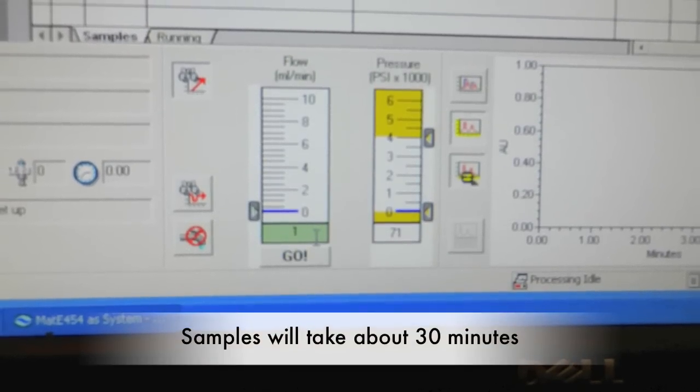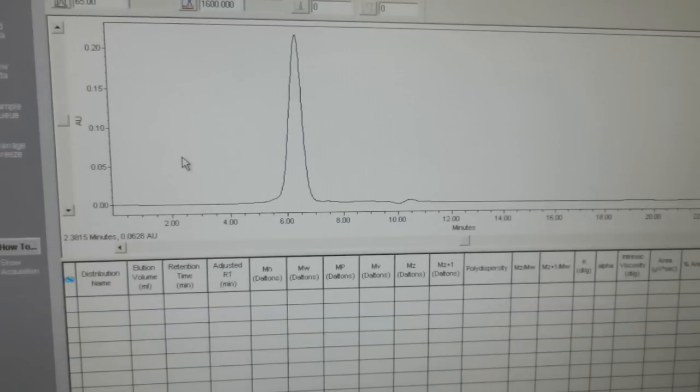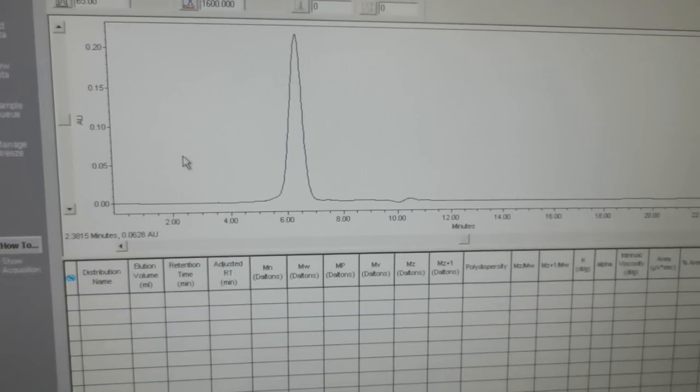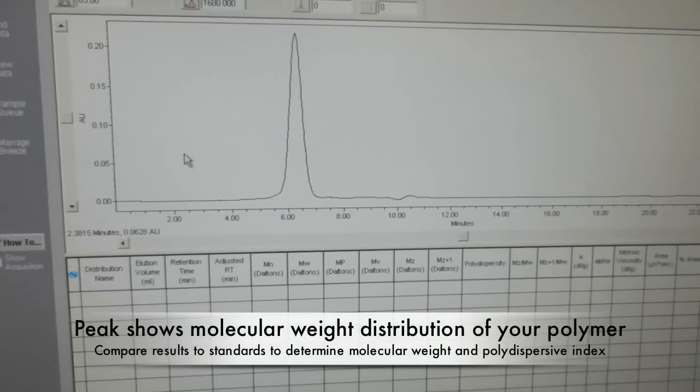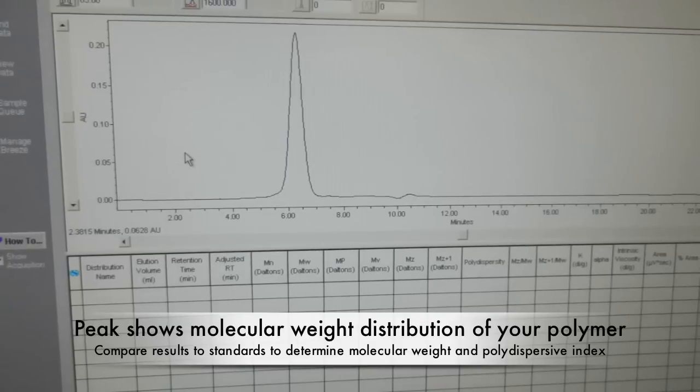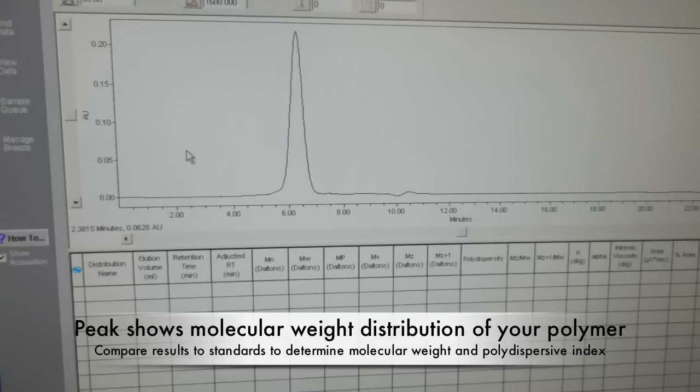It will usually take 30 minutes to complete the analysis of your polymer, and a graph will be shown at the bottom of the screen. Your graph will show a peak that describes the molecular weight distribution of your polymer. By comparing the running time with the standard provided, one can determine the number and weight average molecular weight, along with the PDI or polydispersity index.